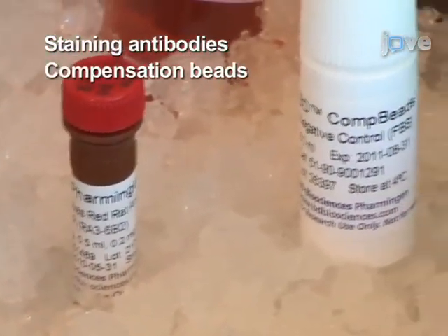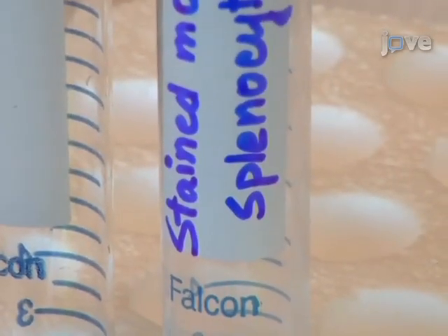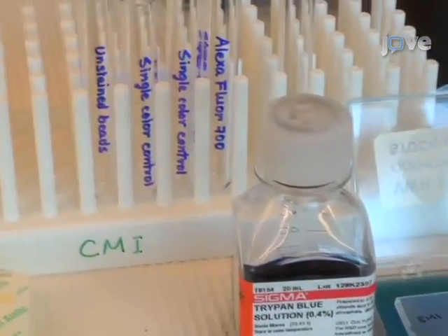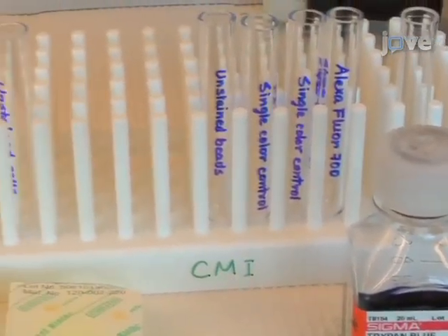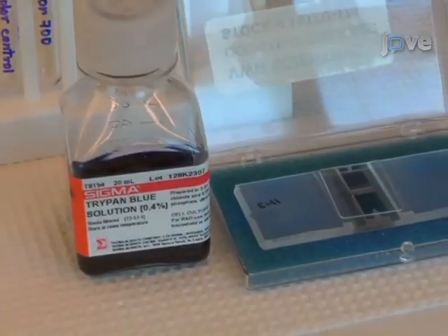Staining antibodies. This protocol also requires the following supplies and reagents: 15 milliliter conical tubes, 12 x 75 millimeter polystyrene or polypropylene flow tubes, a nylon cell strainer, Trypan Blue, and a hemocytometer.